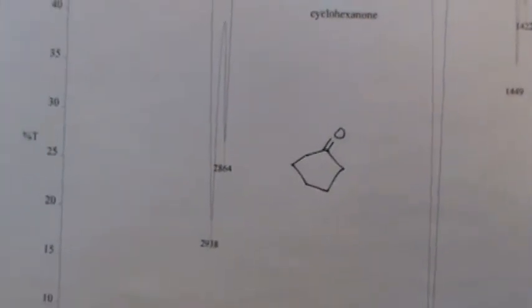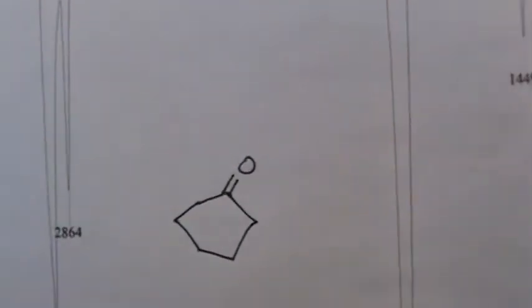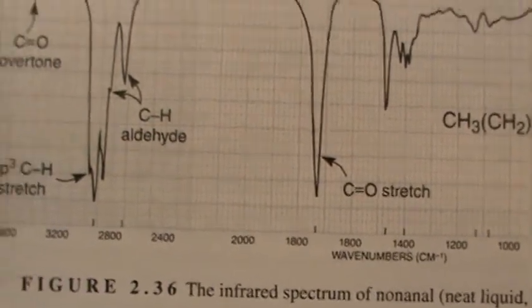So anyway, your product. This is pretty much a done deal. There's your alkane, carbon sp3, hydrogen stretch. You have a carbonyl, so the only thing with a carbonyl functional group that you're ever going to label, yet again, you go to Pavia and you remind yourself what it is that you're looking for. And whether it is an aldehyde or even a ketone, everybody knows the classic carbonyl stretch is the big strong one right around the 1700 mark.